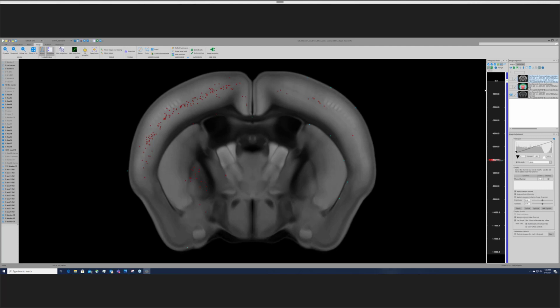We've actually done this in a publication with Mac Hooks, and what we determined was that the accuracy of the registration was within, on average, about 80 microns, which when you think about it, is pretty accurate. The way we did that was to take these fiducial markers in a number of different regions of the brain and determine what the offset was between what the registration did and what the actual position was in the Allen space. On average, it was about 80 microns.